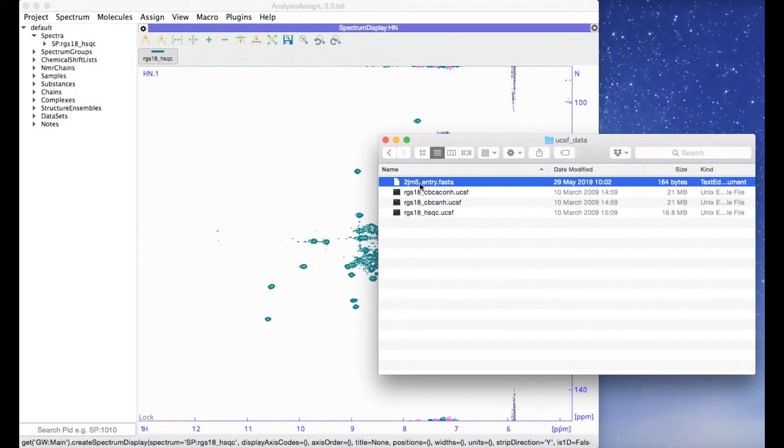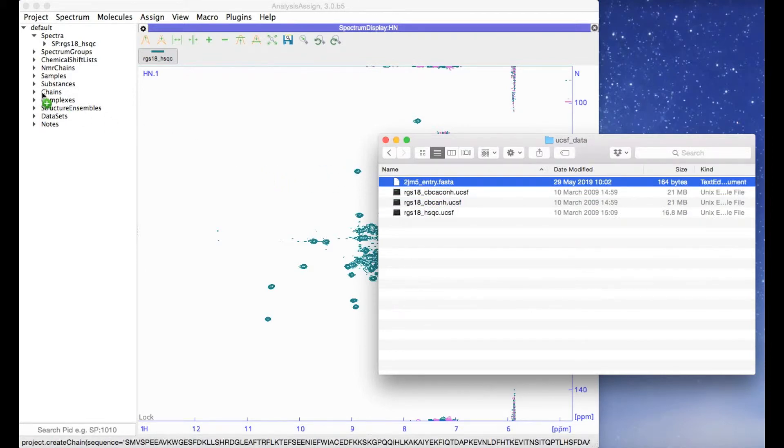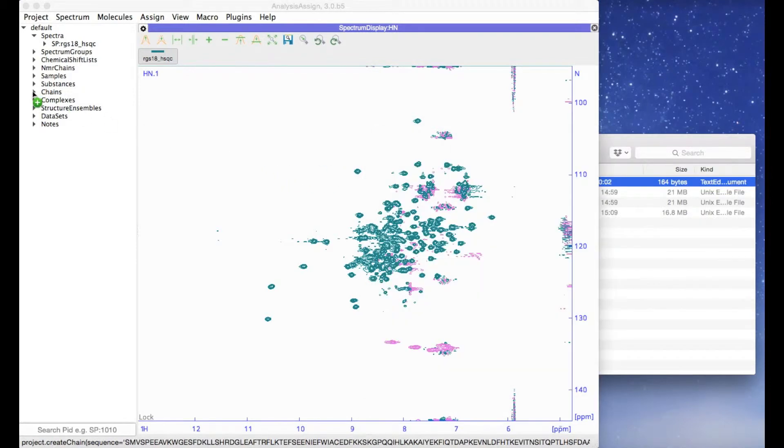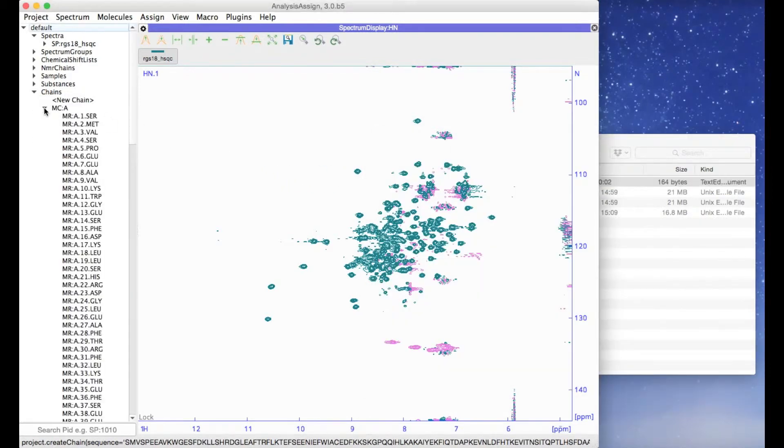If you have sequence data, again, you can just drag and drop it and it will be in your project. The same with PDB files or any other NMR-related data.